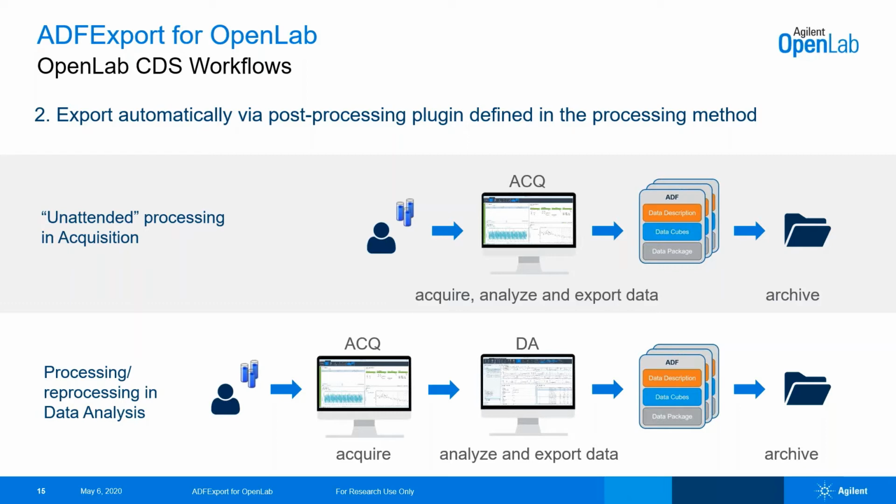In the second scenario, it can be that you acquire your data first and afterwards load your data in data analysis, review and process your data, and you get an ADF file, which you can use for archiving purposes.